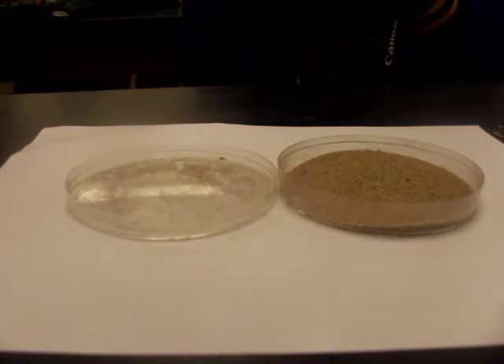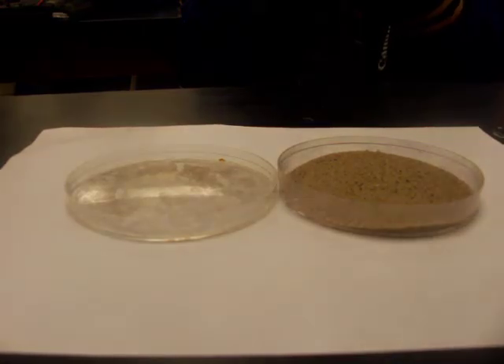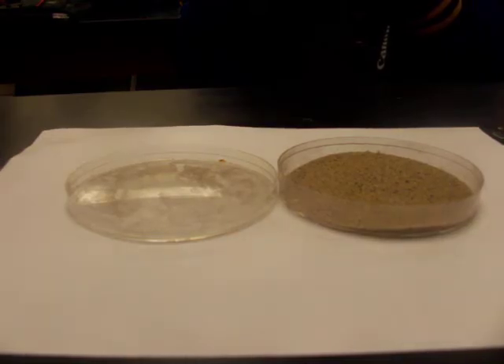Here we have a mixture of iron sand and salt, and we're going to go through a process to separate the three chemicals. The first thing we're going to do is work on separating the iron away from the sand and salt mixture, and to do that we're going to use a magnet.